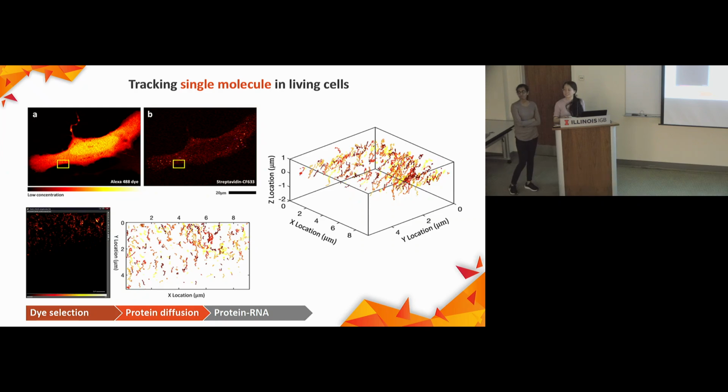No, it's so you can do two color. It would be nice to do two color images with MINFLUX, right? It's difficult if you have to set up two channels, because you don't know which molecule you're tracking when you start. So you put a dichroic in and split your beam, and you add them together when you're doing the tracking. Then at the end, you look at the ratios of those two after you've done the localization, and that will tell you which color it is. So that's how you can do two color tracking.